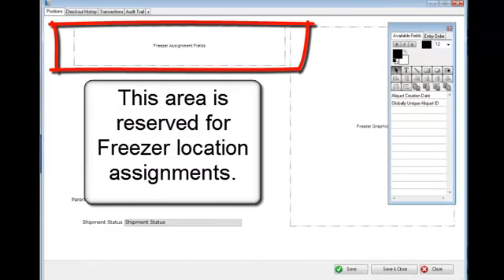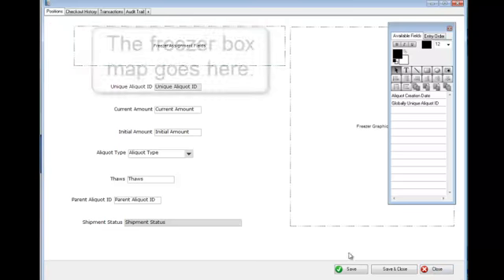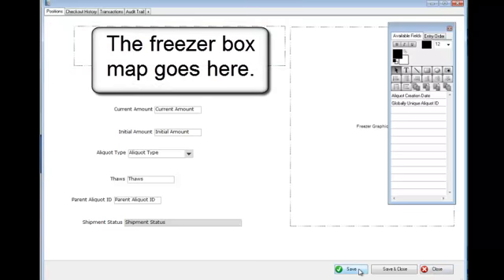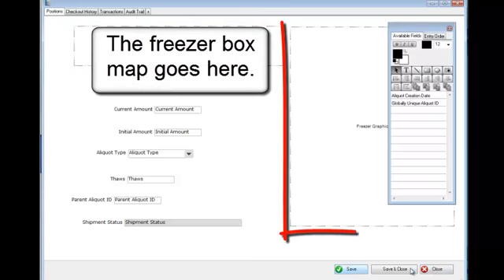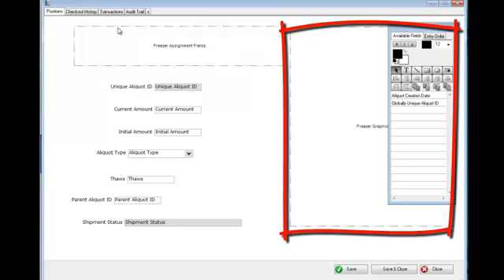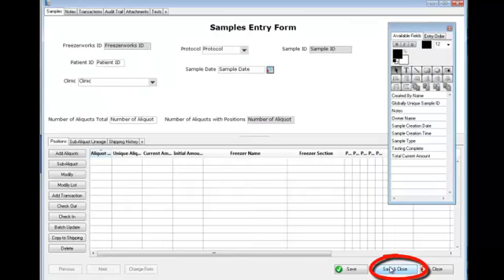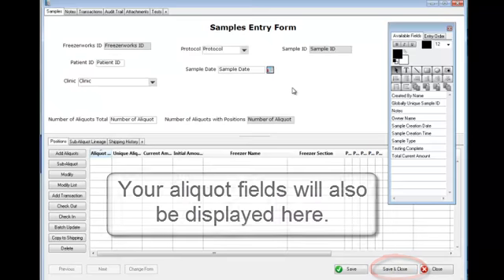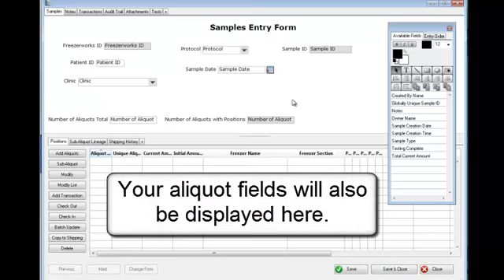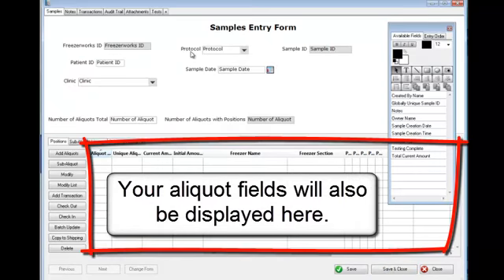This area is reserved for freezer location assignments. The freezer box map goes here. Your aliquot fields will also be displayed here.